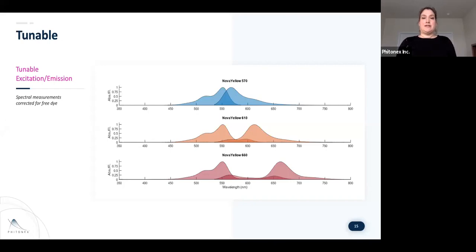And it's really very exciting to be able to look ahead at what we'll be able to do using this, even in your normal panels. So if you have a panel where you're using FITC, PE, and a number of other labels, even being able to expand just what you're doing there in your conventional cytometer is pretty astounding.